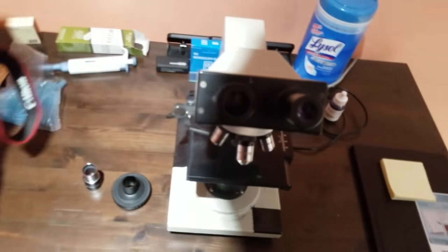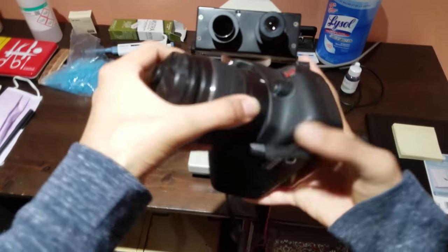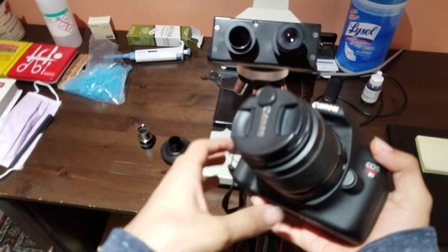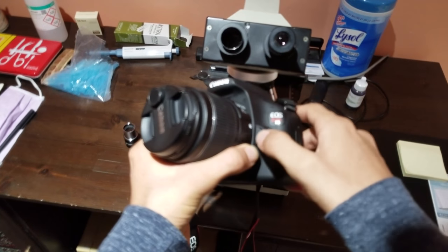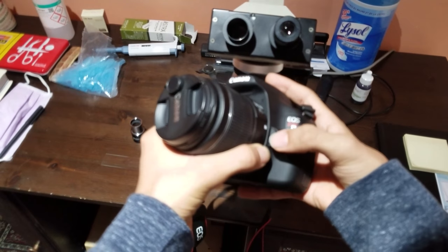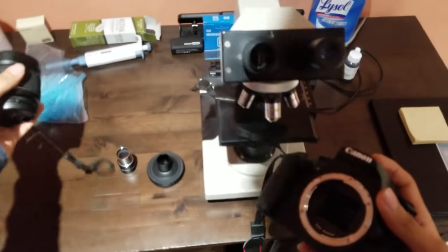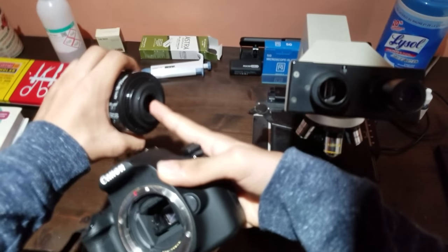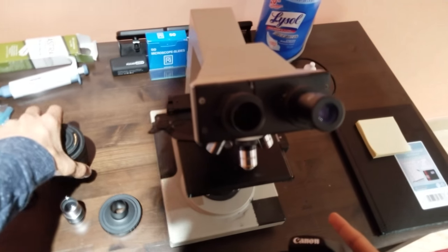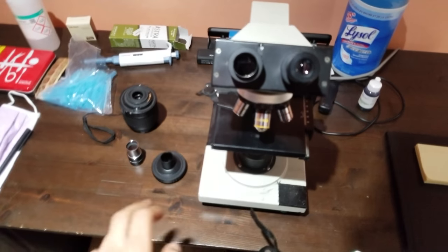And then you're going to take your camera, and your camera will obviously have a lens already attached to it. And we can't use this lens together with the adapter, so we have to take the lens off. And most cameras will have a lens detach button, and this one is right over here. So you can press that button, turn the lens, take it off, and then make sure that you don't put the exposed side of the lens on the table. So make sure that's all put away.